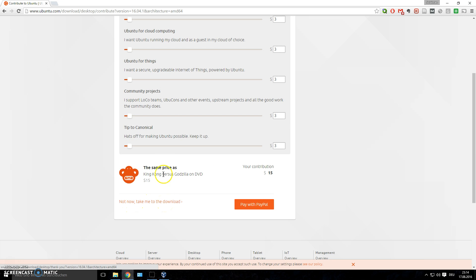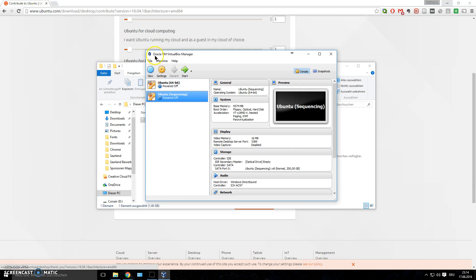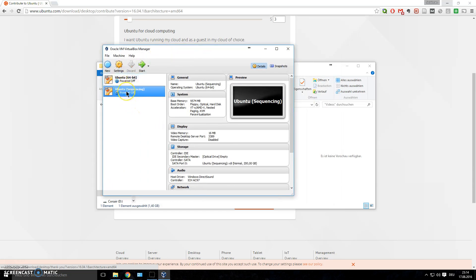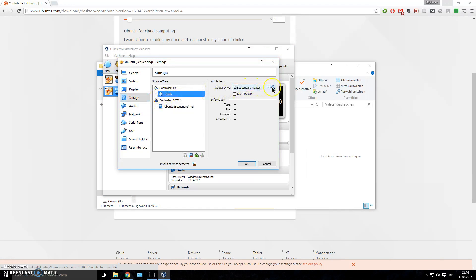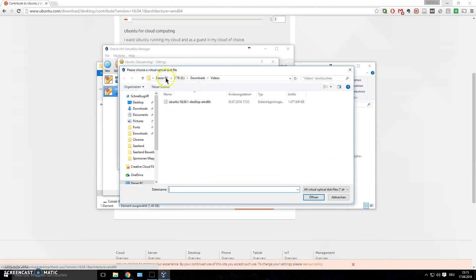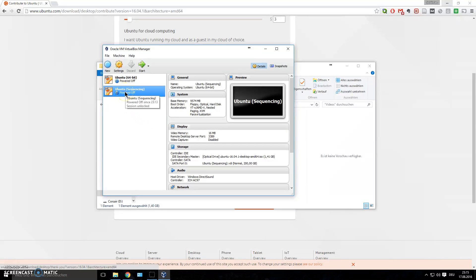It will ask for a donation — if you prefer the free option, just click 'Not now, take me to the download.' It will download an ISO image file, which is essentially a virtual CD. Double-clicking it won't do anything — you need special software like VirtualBox to read it. Right-click your virtual machine, click Settings, go to Storage, click the empty CD icon, choose 'Virtual Optical Disk File,' navigate to your downloaded ISO file, click Open, then click OK.